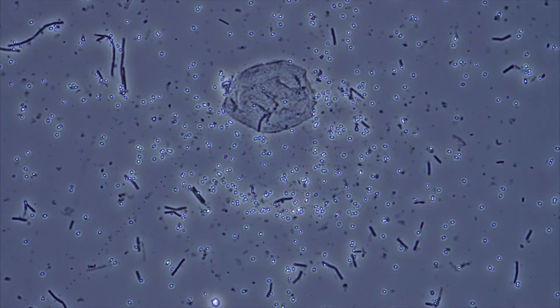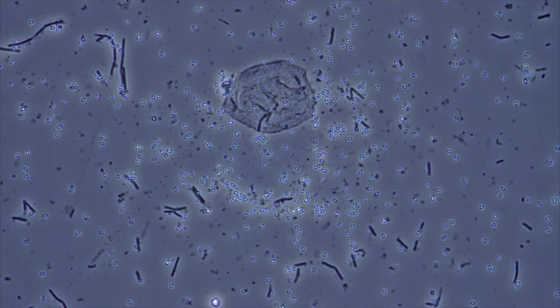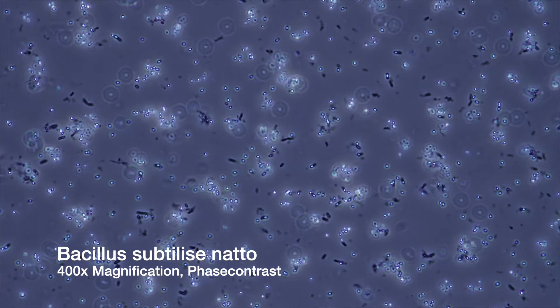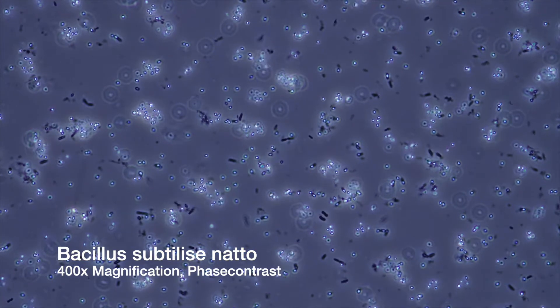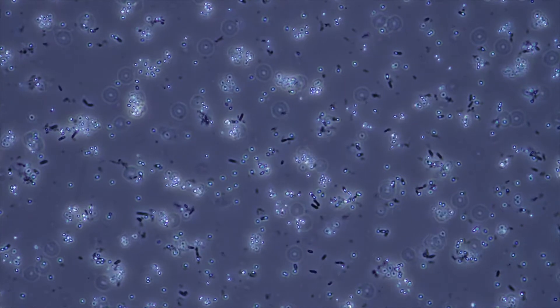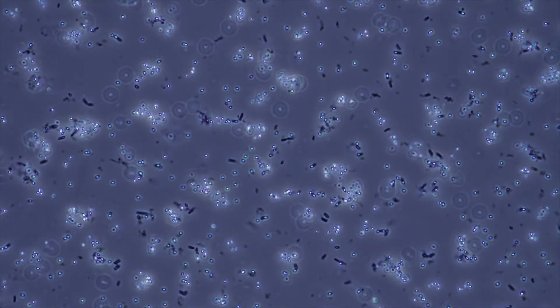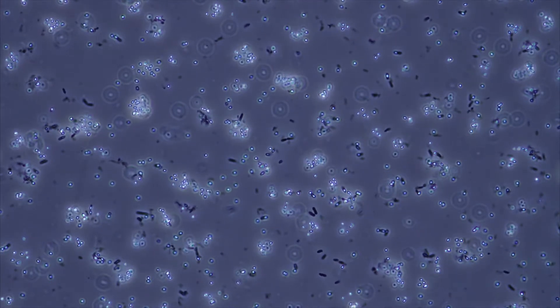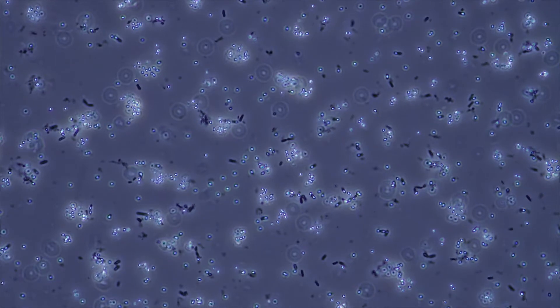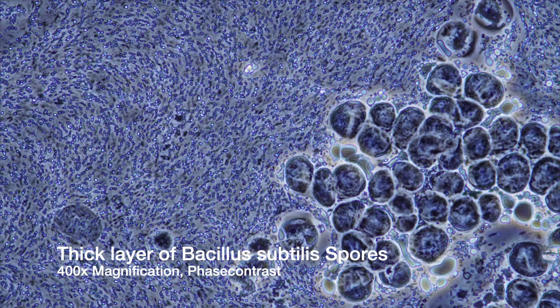Bacillus subtilis depends on oxygen but can also survive anoxic conditions. Natto is produced by aerobic fermentation. In order to keep its taste pleasant, the producers must control oxygen content and temperature carefully. Without oxygen, the bacteria start to use nitrate as an energy source. If the oxygen supply during production is insufficient, the end result would be more or less pure ammonia. The little bright dots swimming across the screen are bacteria spores — the dormant stage of the bacteria, which are extremely resilient to temperature and drought, and at the end of the fermentation process about 80% of the biomass in the gooey natto strings are bacteria spores.